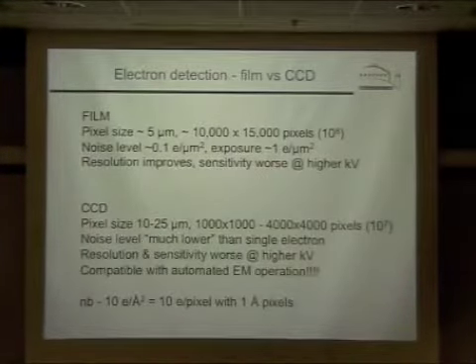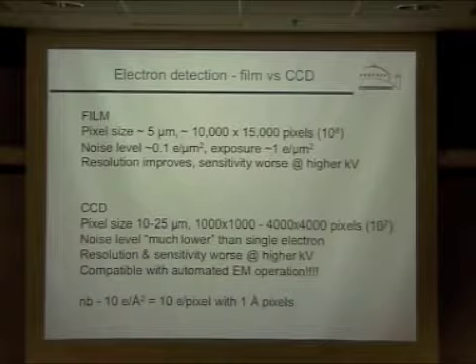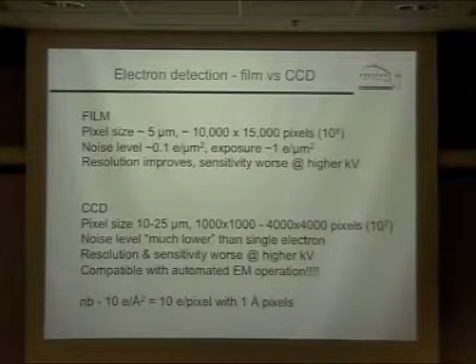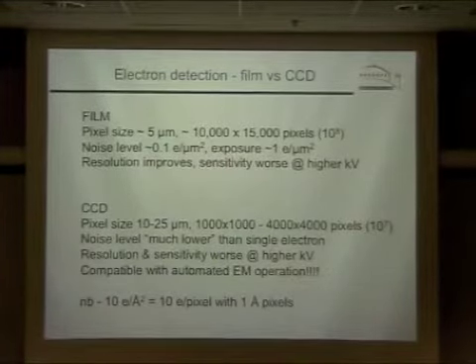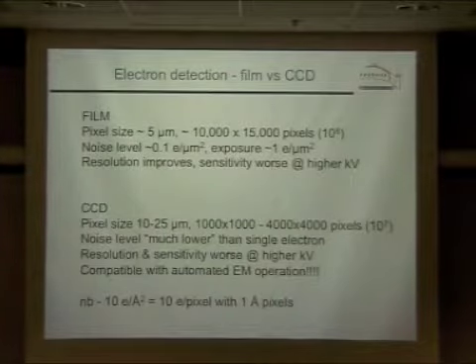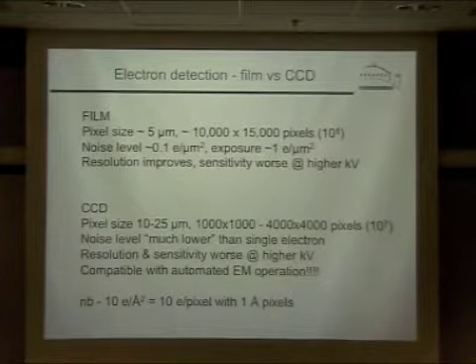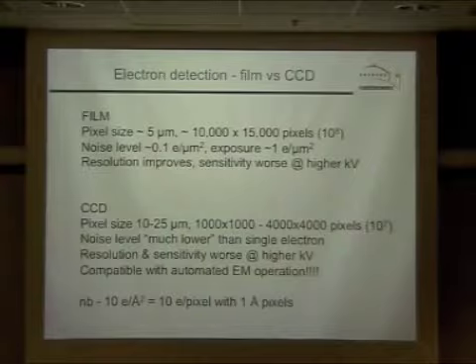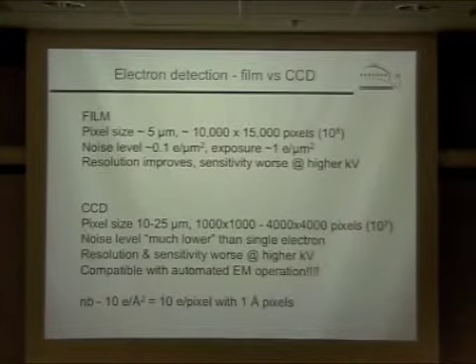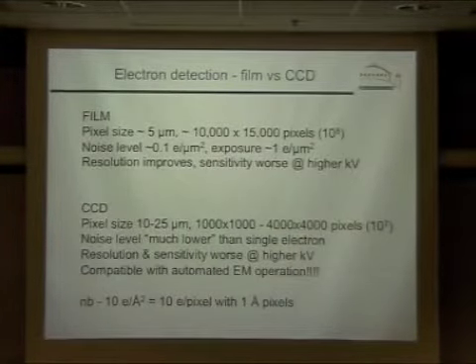But the fact is that they don't often give us 4,000 real pixels. With film, of course, you can get 10,000 pixels on edge. You could digitize at 5 microns and get a lot more than that. We're digitizing typically at 6 1/3 microns. You end up with a file that's 225 megabytes in size. That was the size of our original hard drive when we first bought our own hard drive. We should all be striving for going way beyond what we can do right now, of course.